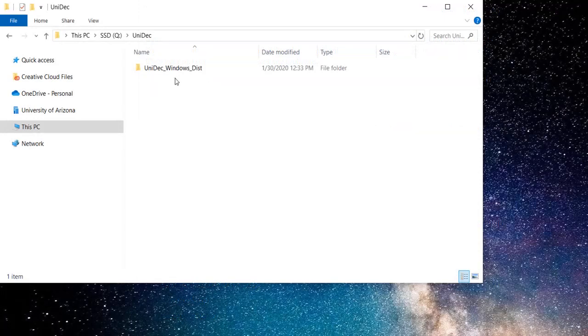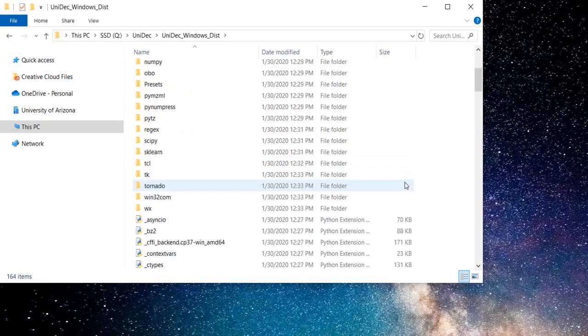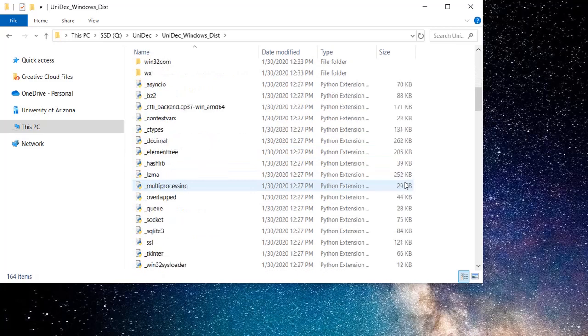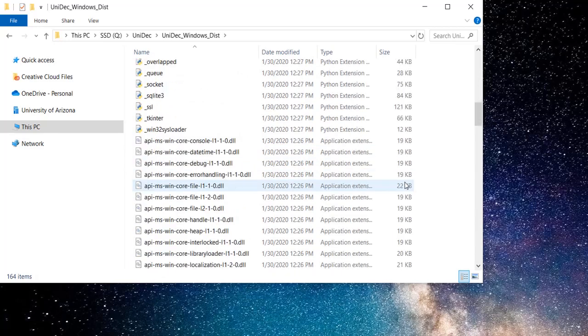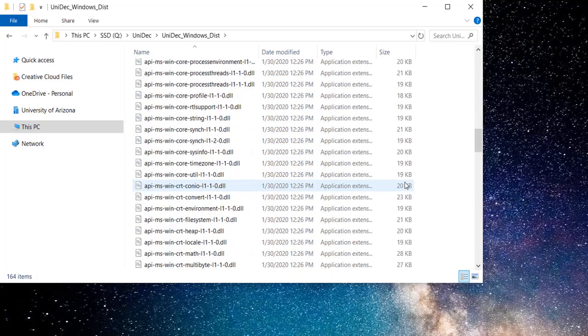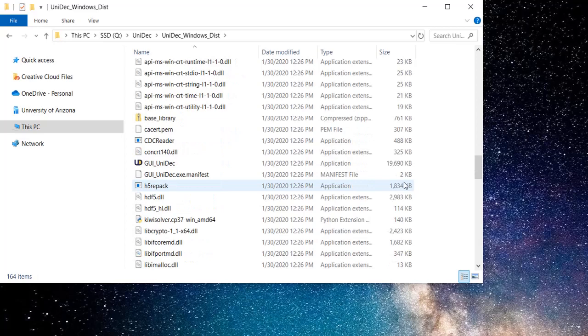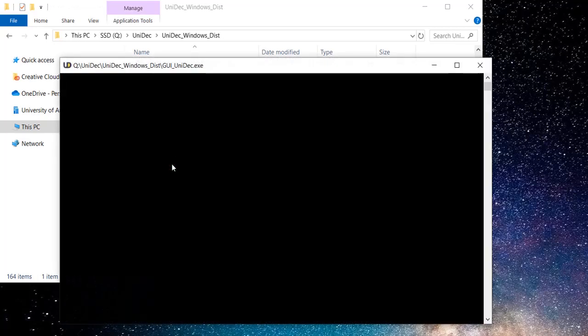Open the folder within the zip file and scroll down until you find GUI Unidec. Double-clicking this will launch the application.